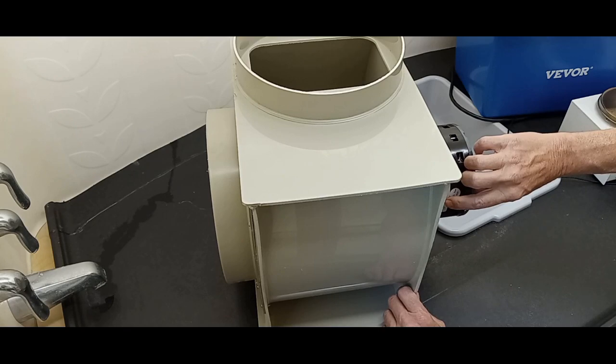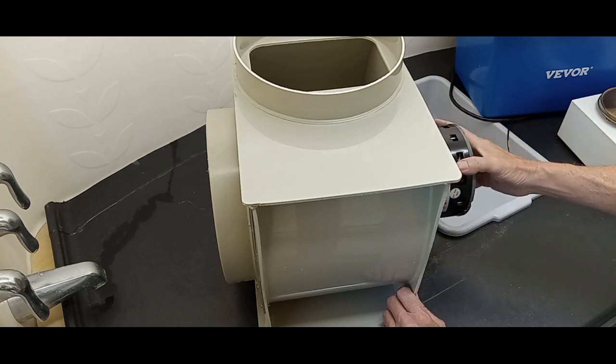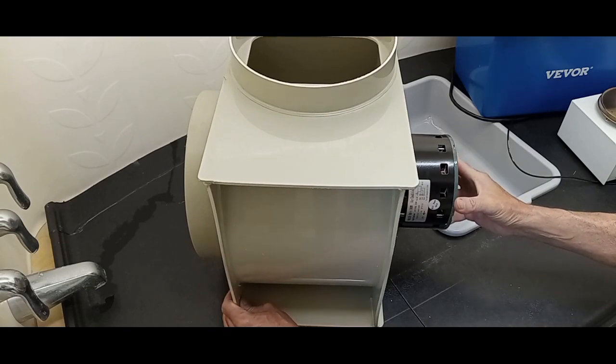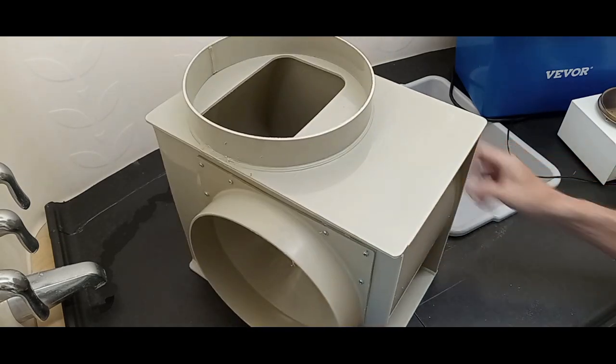so the full load amps is 3.5 at 110 volts. The motor is actually slightly larger than what I really expected on it.